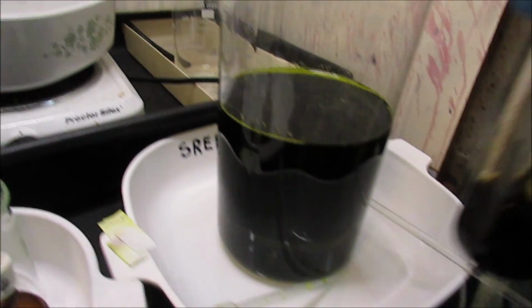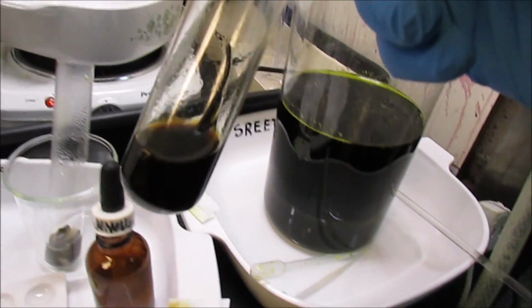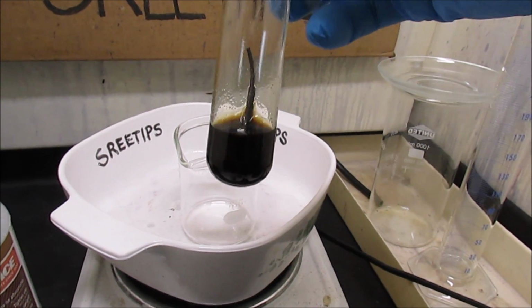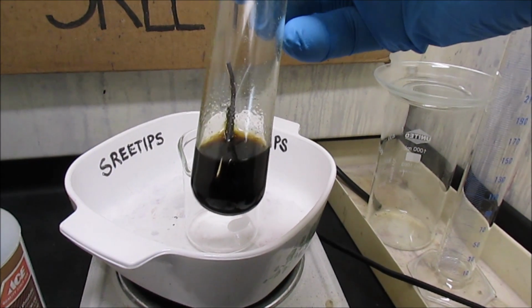This is some of the solution out of this beaker with some pieces of copper wire in it, just to see what would happen. And copper's not reactive enough. I think that's going to take too long. You can see the metals coming out of solution on the copper. They've turned black.